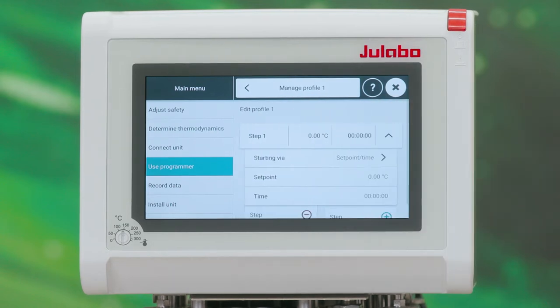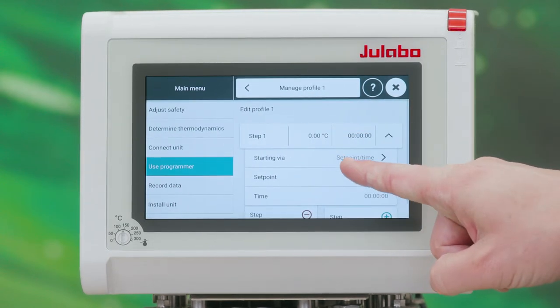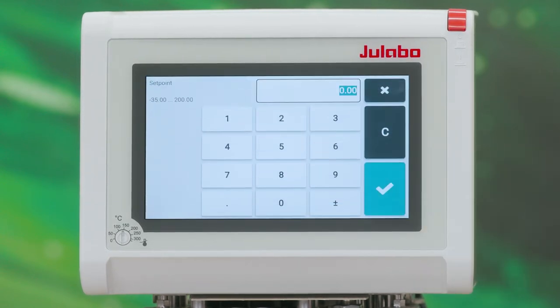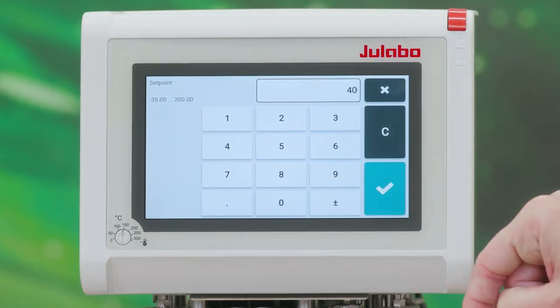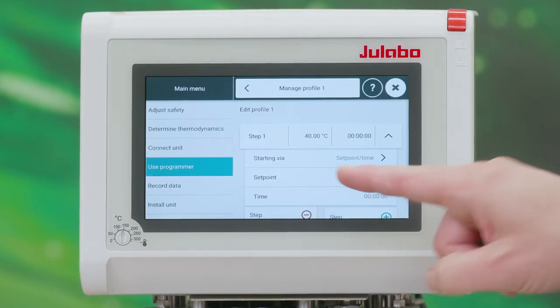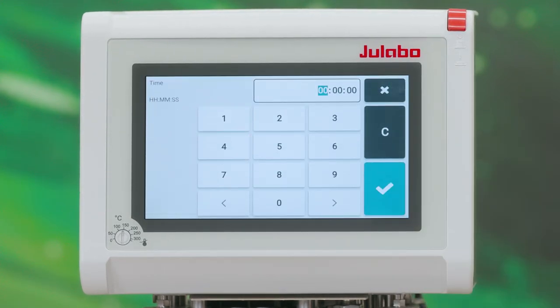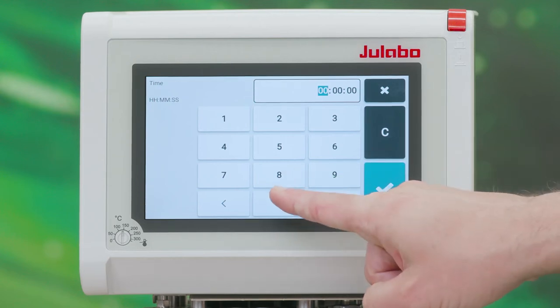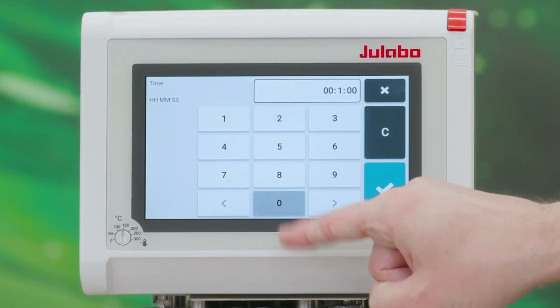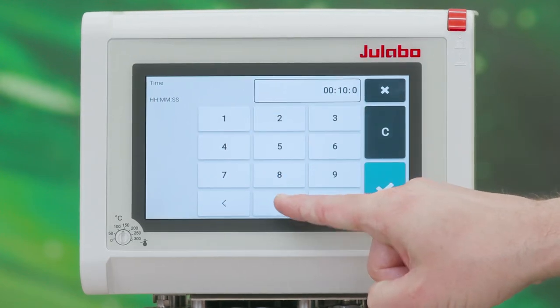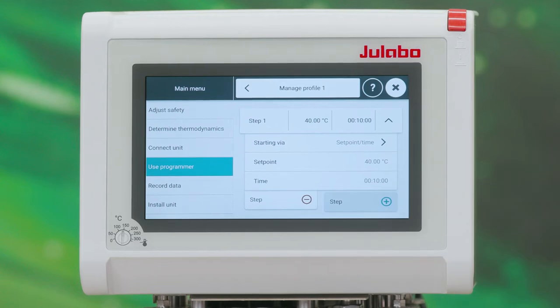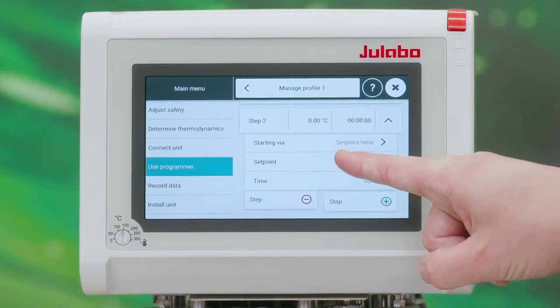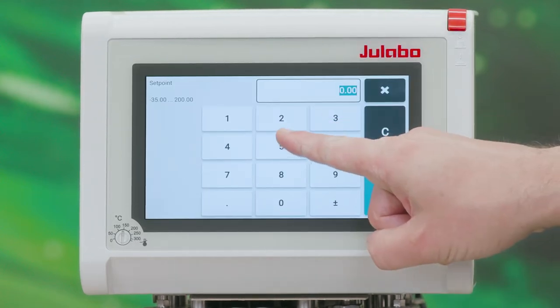For our first step we choose Setpoint Time with a setpoint of 40 degrees Celsius for 10 minutes. For our second step we choose a setpoint time of 50 degrees Celsius for 20 more minutes.